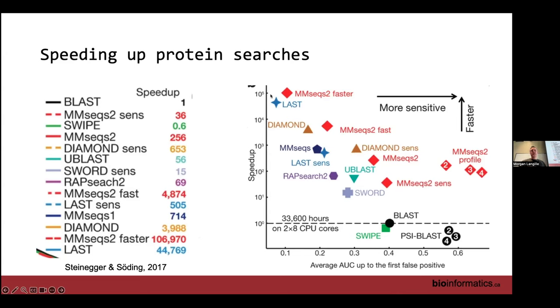But essentially you'll see a ton of papers, and I can't even keep up with how many people have made their own pipeline to do functional annotation and sometimes taxonomic annotation. Isn't it also that some of them are a little more specialized? Like I know there's SAccharis, which is all about carbohydrate metabolism genes. Sure, absolutely. And HUMAnN is mostly for human-associated microbes, right? So you're kind of lowering your possible hits. No, I'm just joking. Yes, for sure, absolutely.